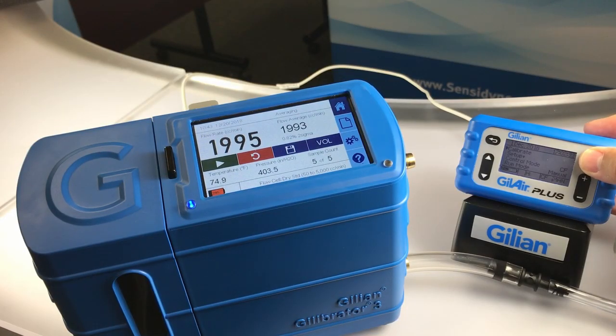Connect the pump to the Gillibrator 3 with your sample media in line. Plug in the cable set from the back of the docking station to the Gillibrator 3. Then hit enter to begin the calibration on your GillAirPlus.